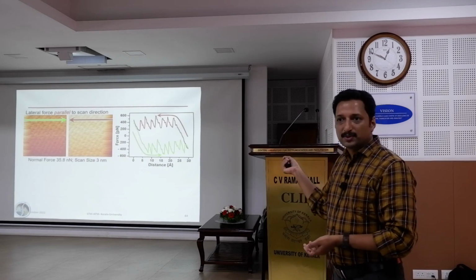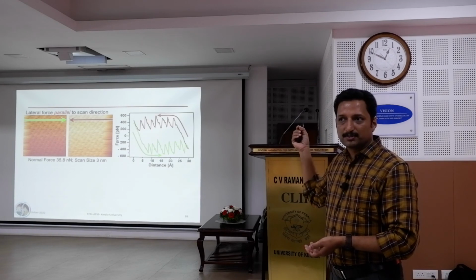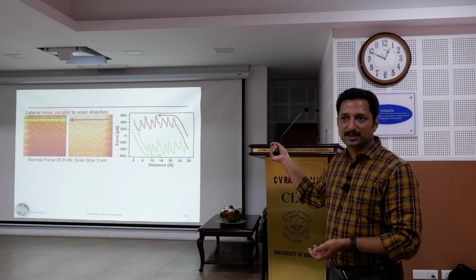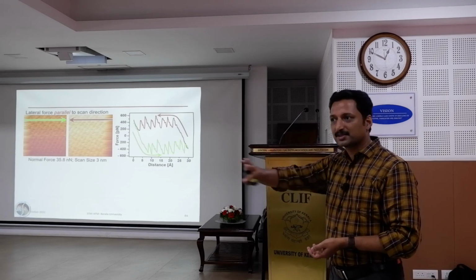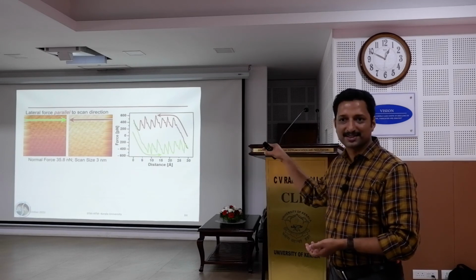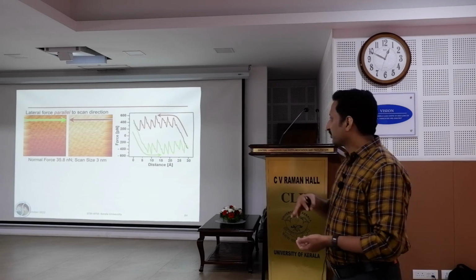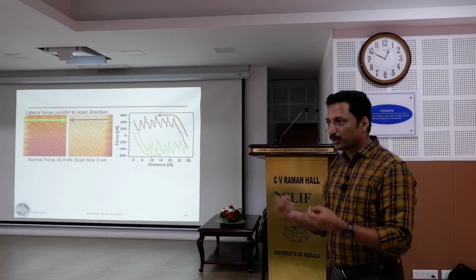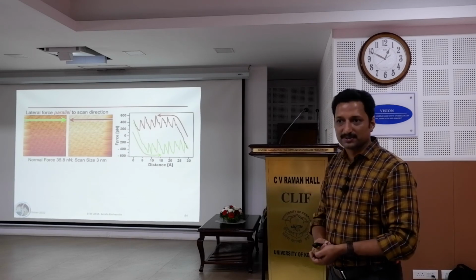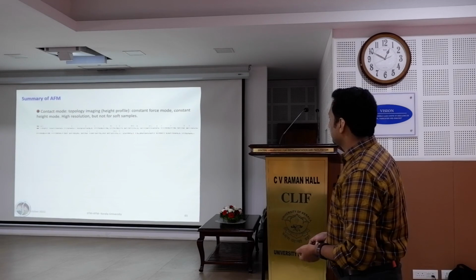When we published this one, now I think it has more than 200 citations already, because accidentally biology-related researchers are citing it. What happens is that here also we can see the force between atoms, between biomolecules and receptors, all those things. Yeah, I think that's it.